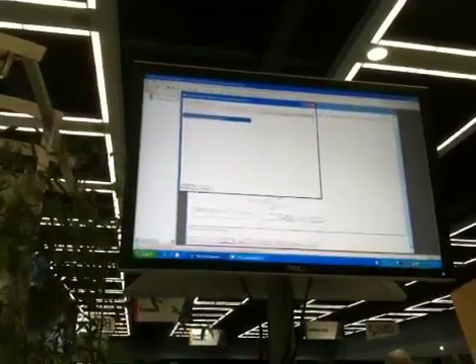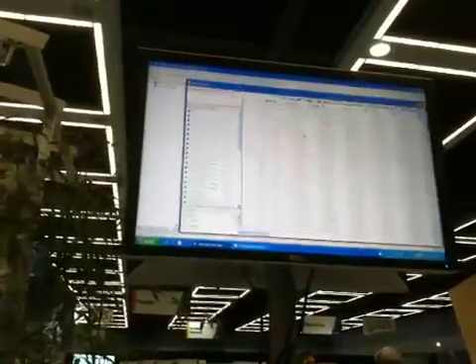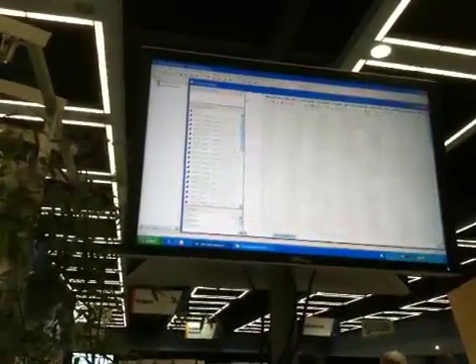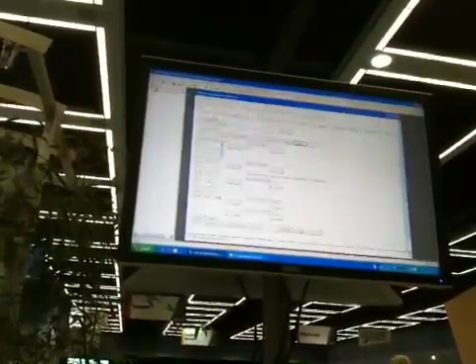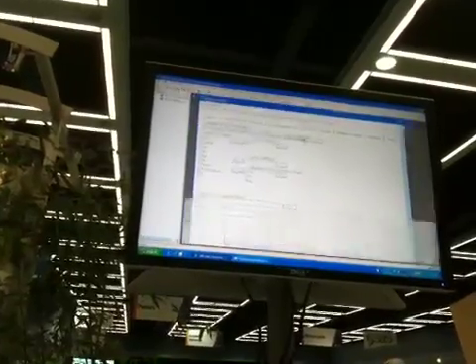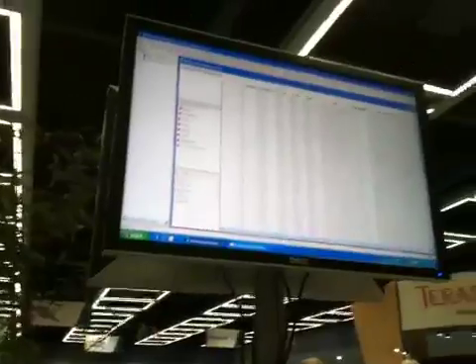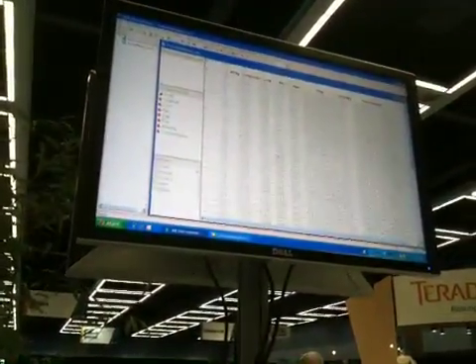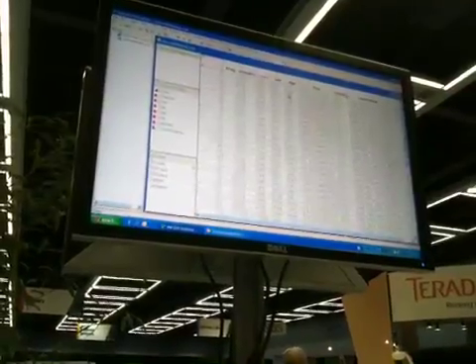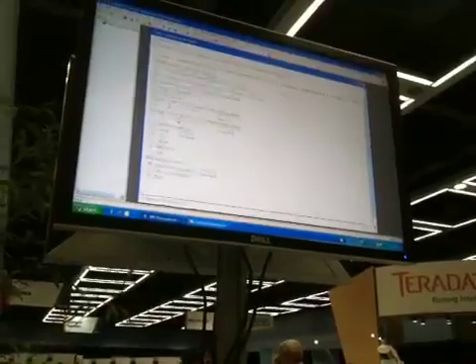And we have saved settings that actually save out SAS programs that you can load, and you can see what your data looks like. So here we have gene expression measurements across samples for Drosophila data. And you can specify variables you want, as well as your experimental design, which tells you what the design of your experiment was, where the samples came from. Here we have flies that are of different lines, male and female sex, and from different age groups. And we have gene expression measurements over all those design factors.